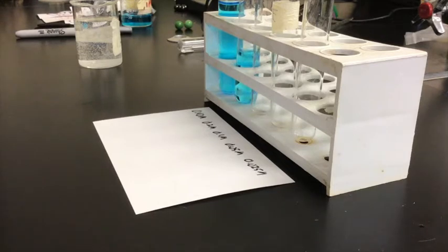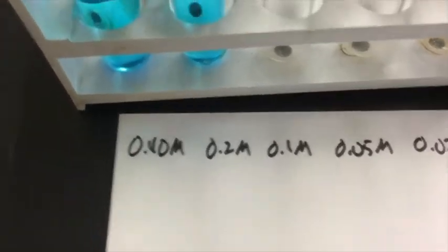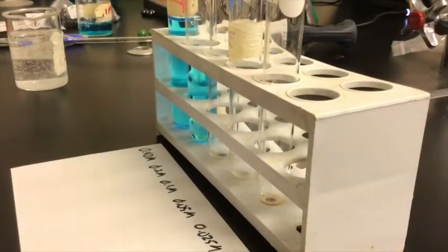And then, because I know that that is 0.4 molar, and it's 10 milliliters of it, if I want to turn that into 0.2 molarity, that is going to be cutting my molarity in half.